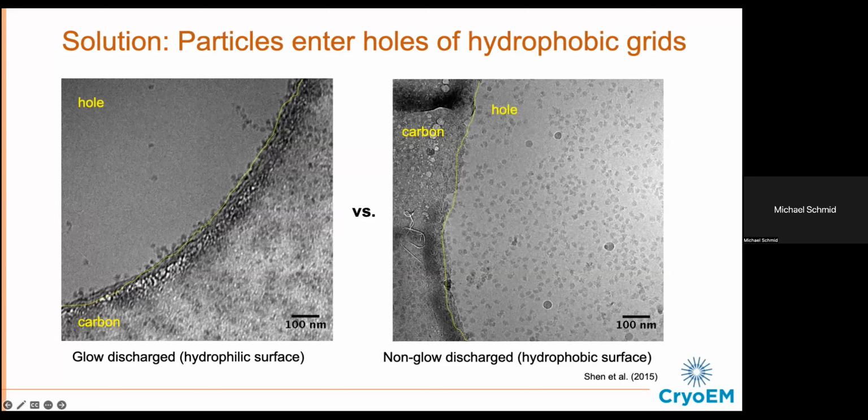For sure. Yeah, Jesselyn, I really appreciate this question. I did try polylysine treatment at the time. And this was also probably around the same time that I started dabbling with just skipping the glow discharge. I don't have a concrete recollection of how those grids turned out with polylysine treatment. But obviously it didn't work, otherwise I would remember it. But maybe I just couldn't even get good ice with it. But I know that there are several examples that swear by polylysine.